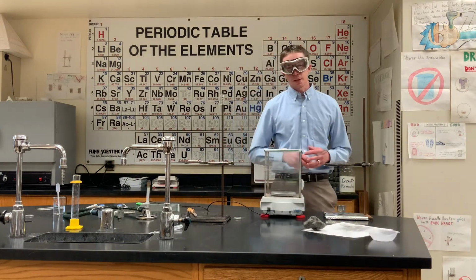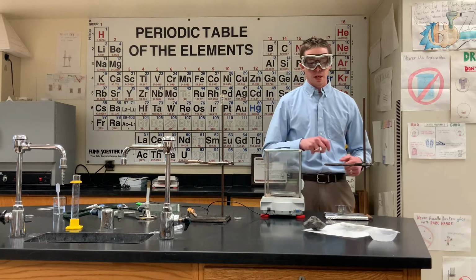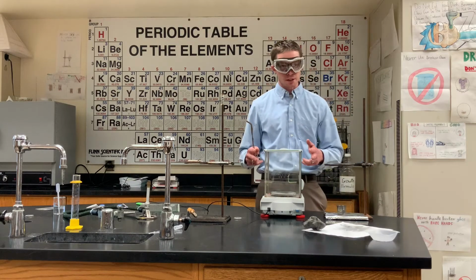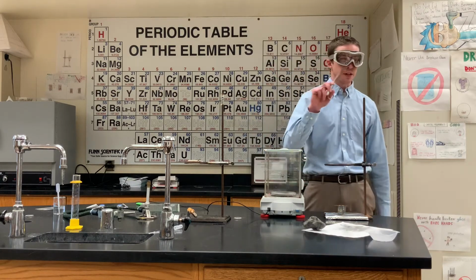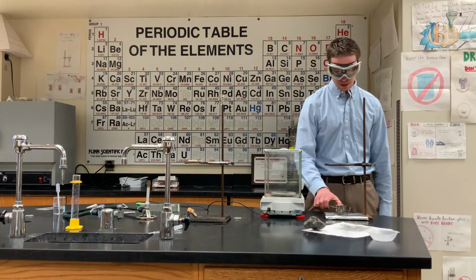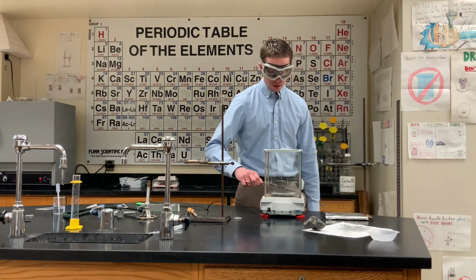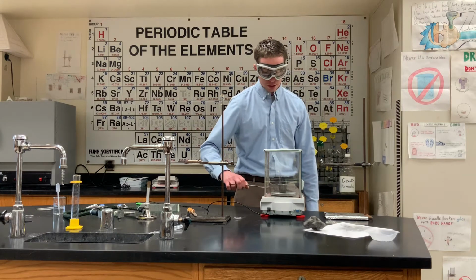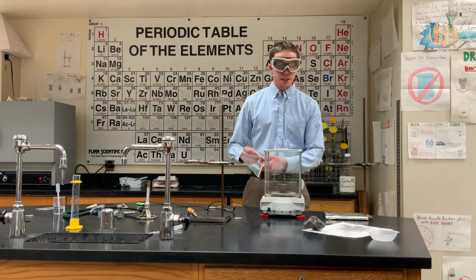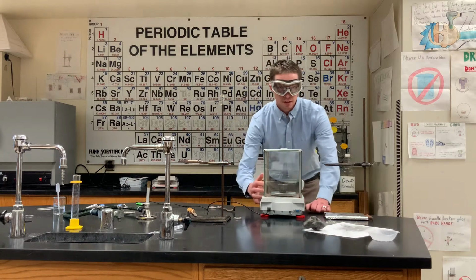All right, so here we are back again. We've burned off the impurities for a good 5 minutes, and now we've let it cool on this aluminum foil. So we're going to put it in this analytical balance right now. Again, now that the impurities are burned off, I'm going to be sure to handle this with tongs the entire time so I don't transfer any dirt or oil. So we're going to put this in the analytical balance here. Throughout the lab, we're going to measure both the crucible and the lid. Now technically this draft guard should be attached to this analytical balance, but life happens.